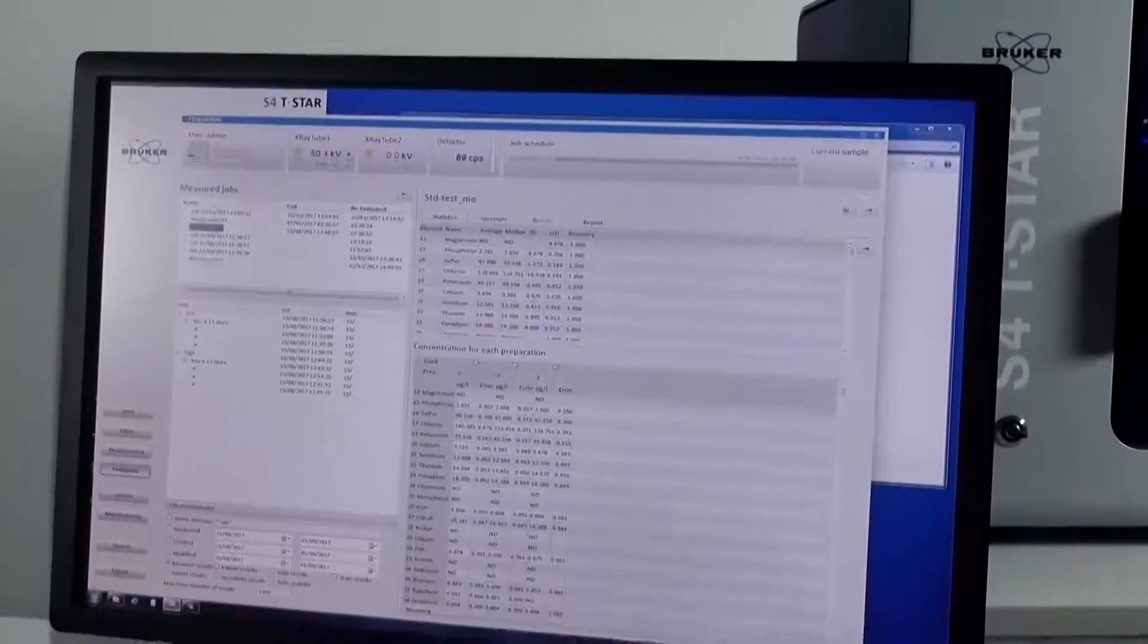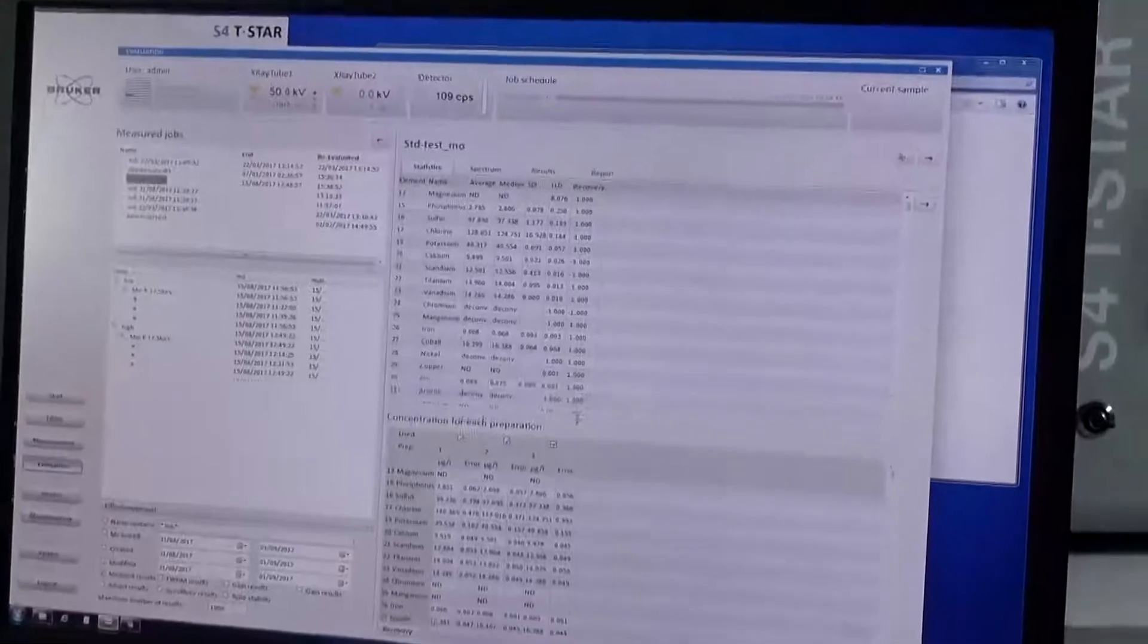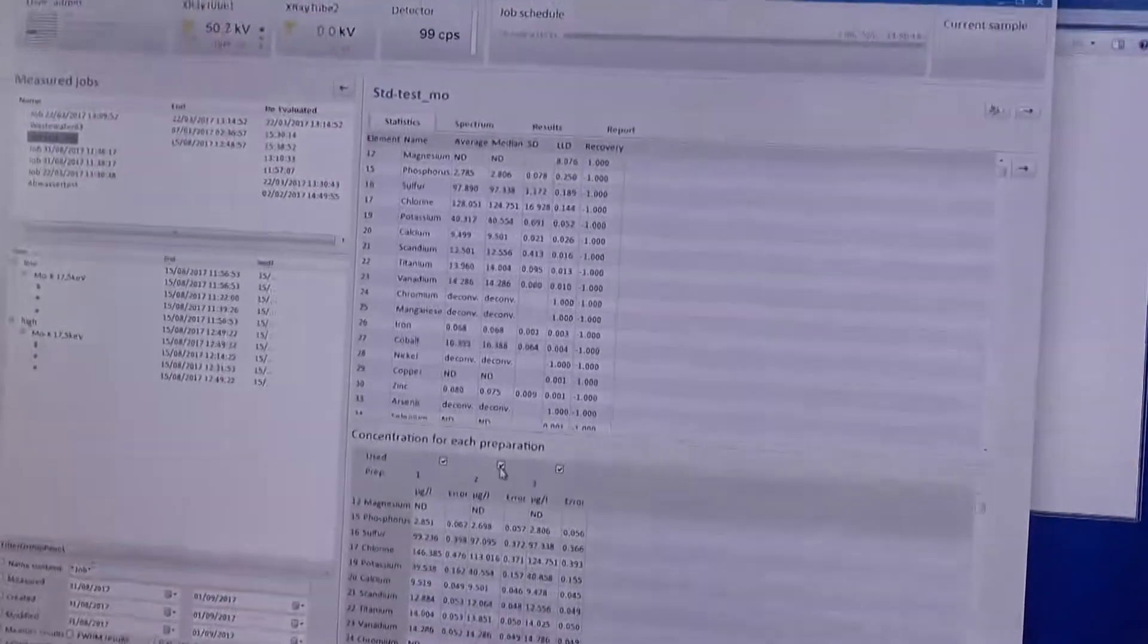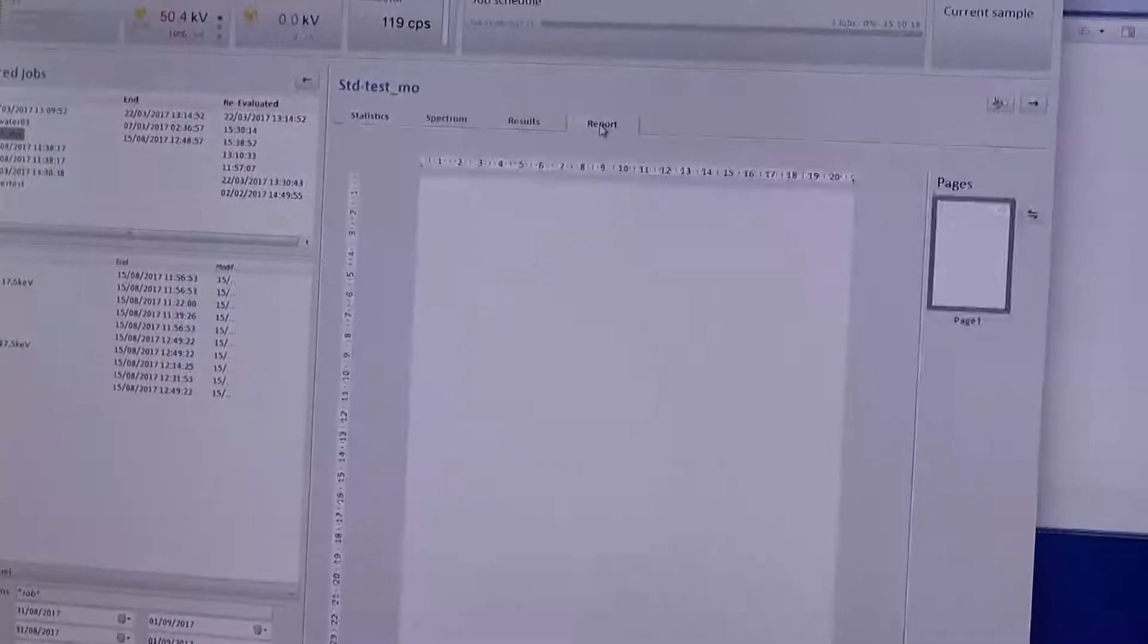The software automatically prepares tables containing element concentrations, limits of detection, and recovery rates for review and reporting.